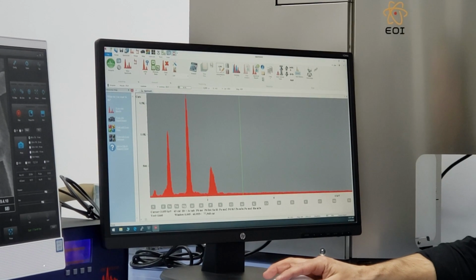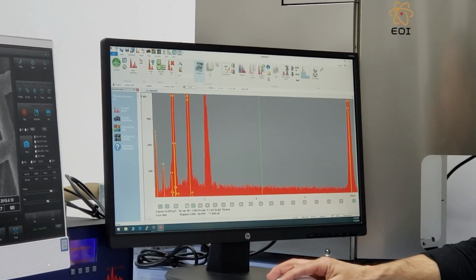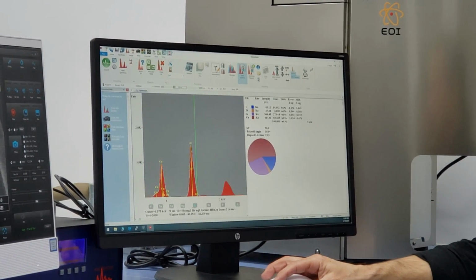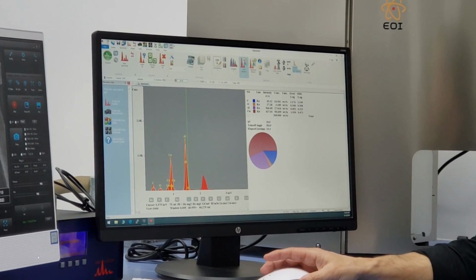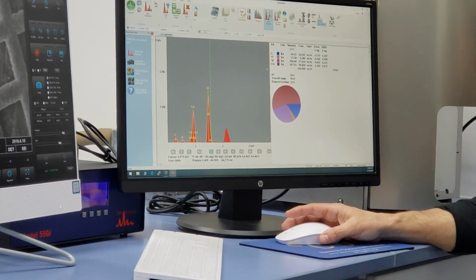Now, after we label this, let's just do a quick auto ID, and let's quantify this. You can see the noise, right? See how much noise we have? So if we analyze this, we quant it. See what it did to the noise? It dumped it. And see this white line that's around the peak? That's the only thing it looked at for the analysis file. So there's algorithms in our quantum analysis file that dump background noise. We subtract it.